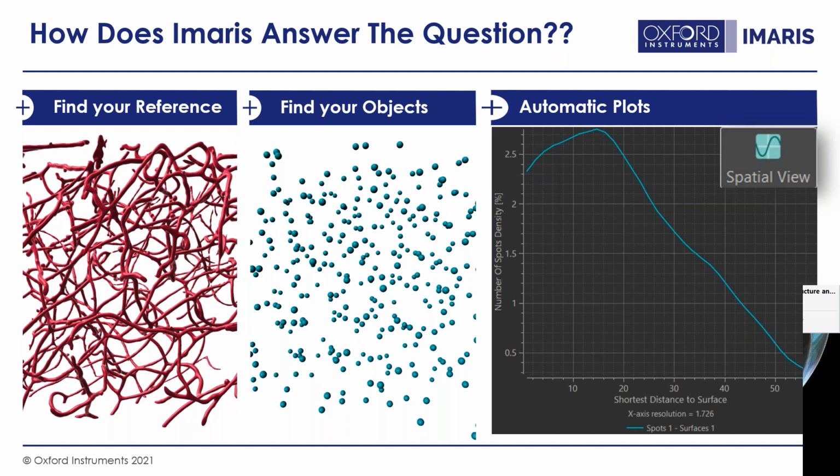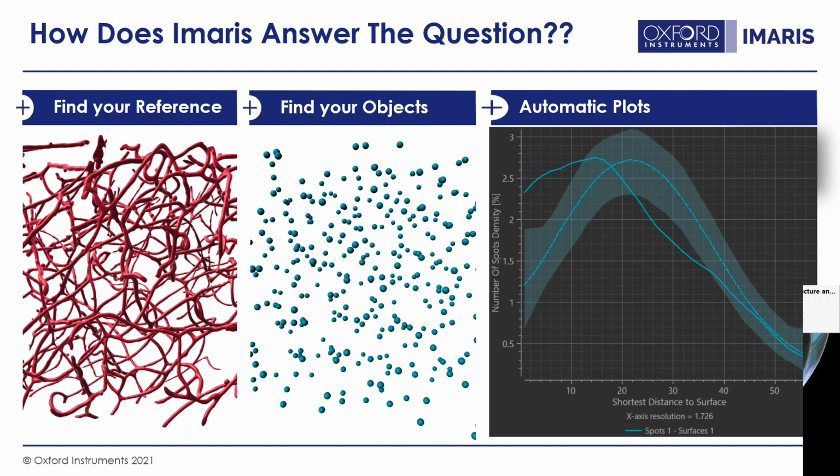But what about these simulations that I spoke about? You can also turn on the option to show what the simulations look like. You see in the dashed line the median value over the course of these 1,000 simulations, as well as a confidence interval for those simulations.